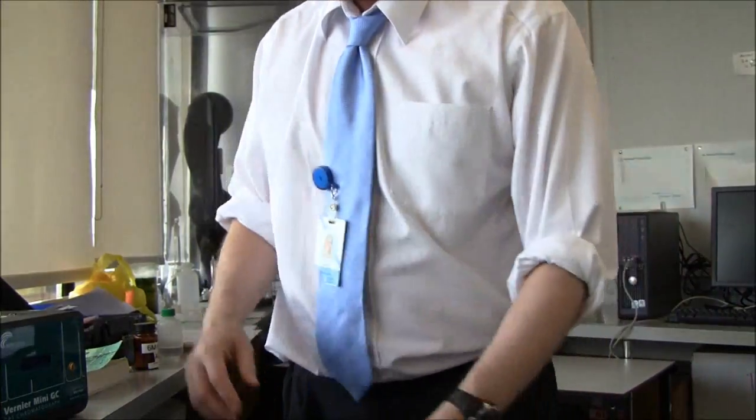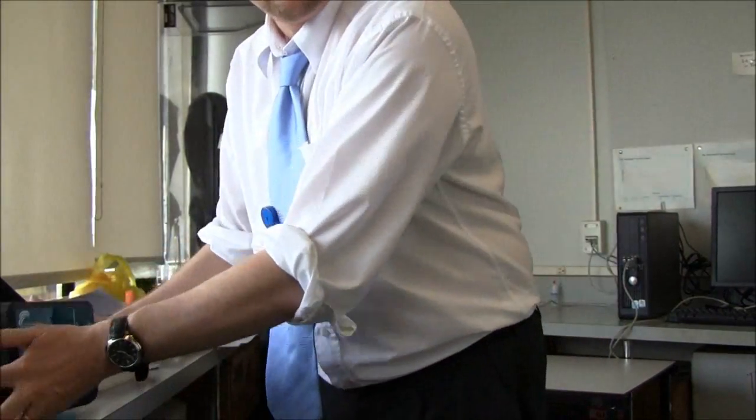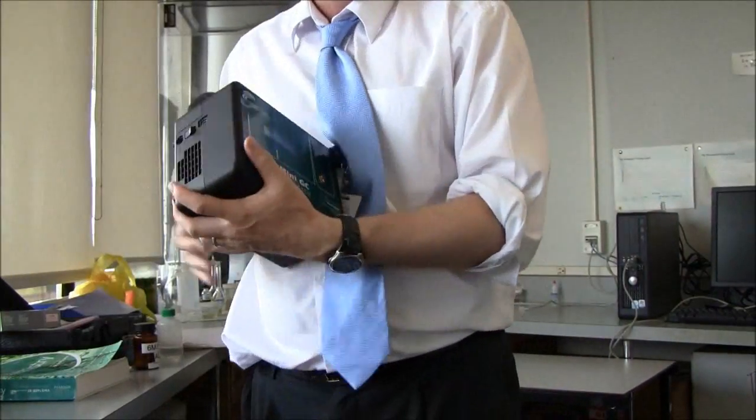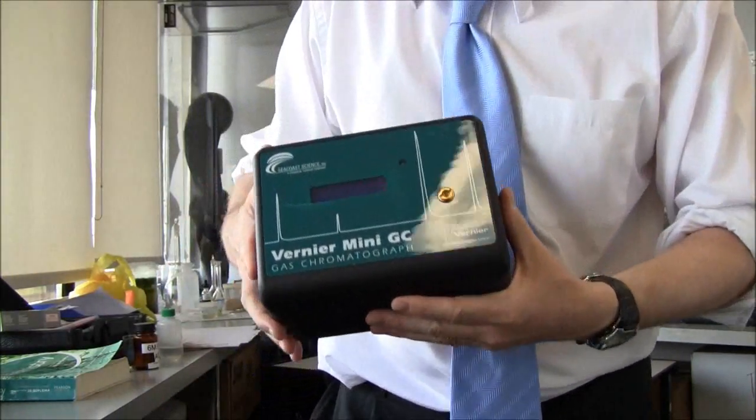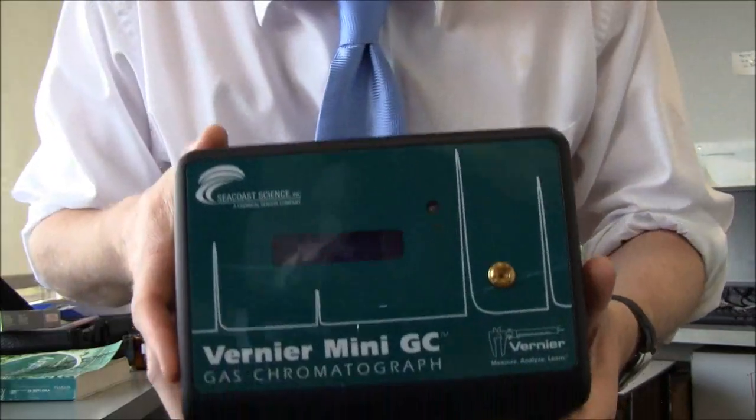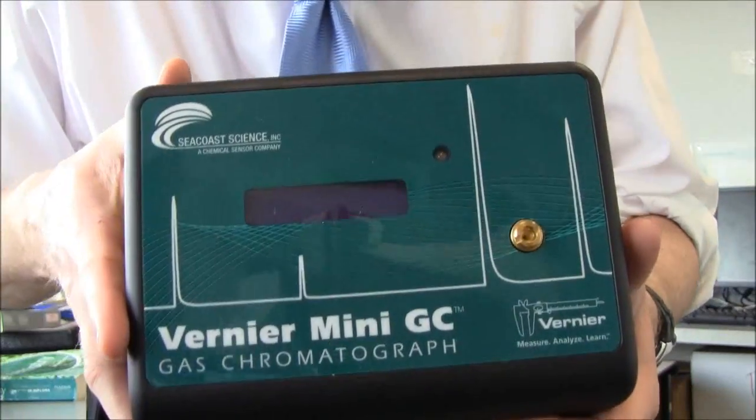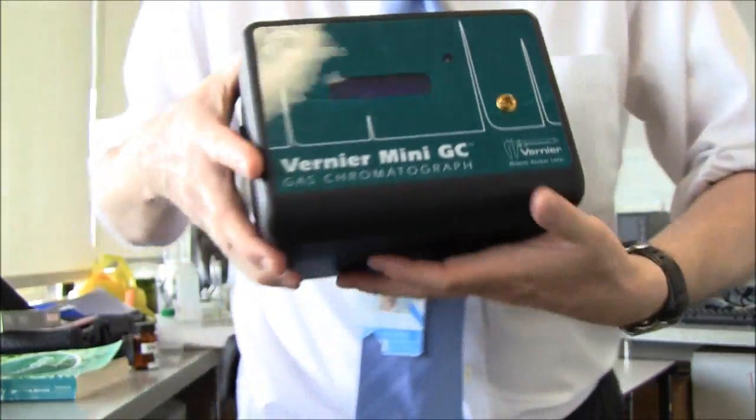This is a video about gas liquid chromatography, a high-level IB topic. This is our $2000 gas liquid chromatograph.